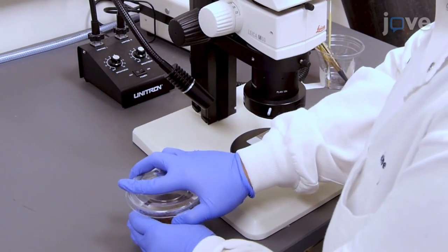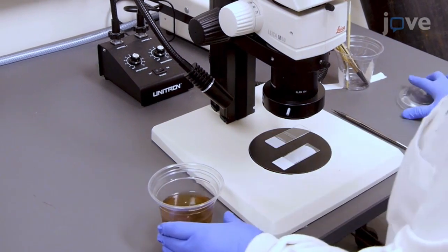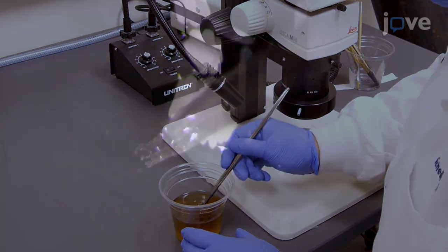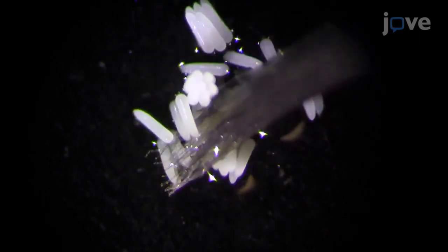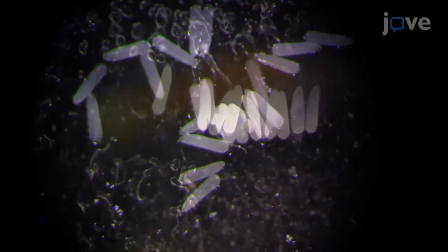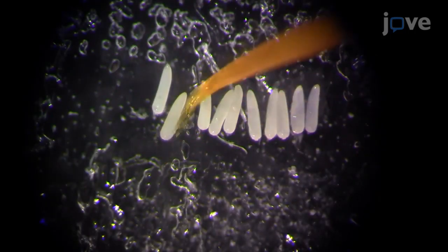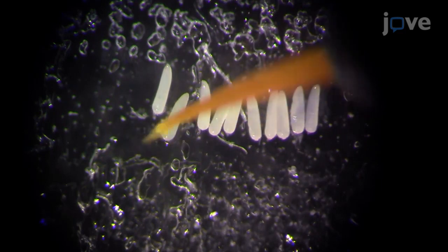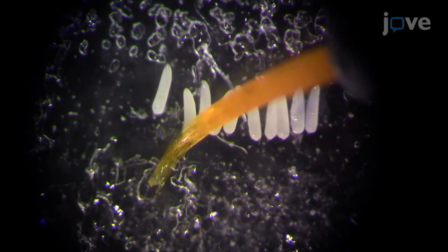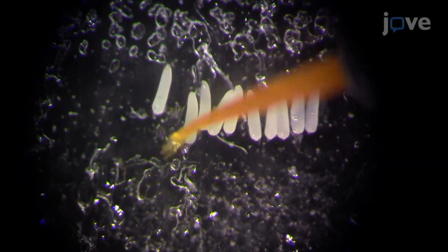Begin by separating the eggs from the rafts. Use forceps or a paintbrush to press down on the raft and tease apart the individual eggs. Align the eggs on a thin strip of double-sided sticky tape placed across the top of a glass slide, making an effort to point the anterior side of each egg in the same direction.